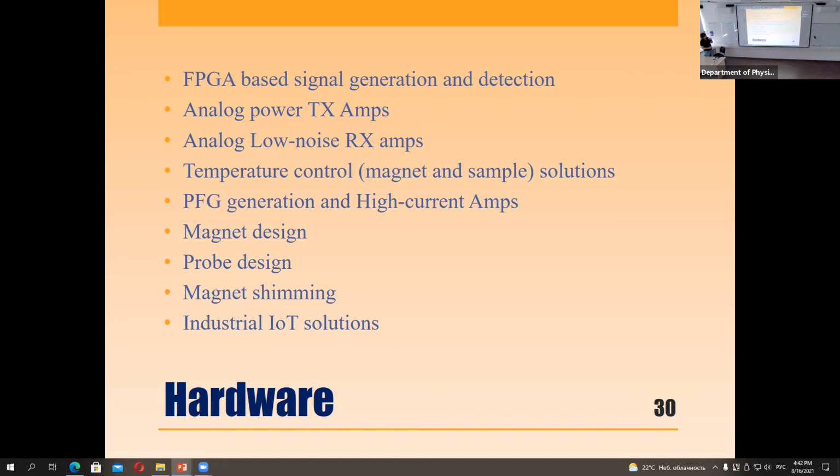Low noise is very important, very critical. Then if you are working with permanent magnets, you must stabilize the temperature because your magnet is drifting, and the normal drift for a neodymium magnet is 1000 ppm per 1 degree. So you need to keep the temperature. We now stabilize the temperature to 0.002 degrees centigrade. It's more or less good for time domain, but it's nothing for high resolution, by the way.